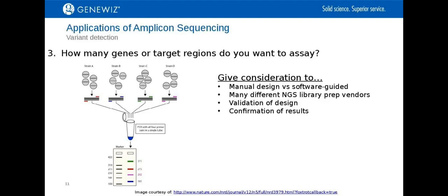Moreover, they're also performing the multiplex PCR, and you need to take into consideration regions that may have dropout due to some various biases when you combine all these primers together in a multiplex PCR. Of course, with any study, I'd recommend validating the results after you do your NGS with many other different types of assays like Sanger sequencing or qPCR.